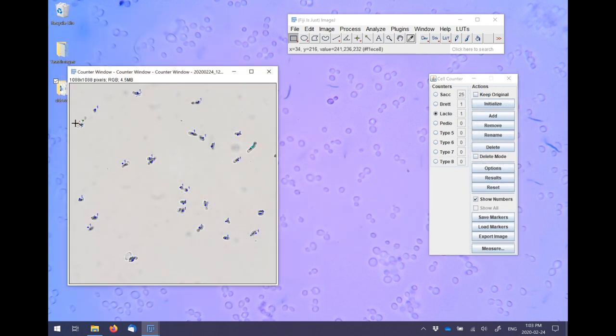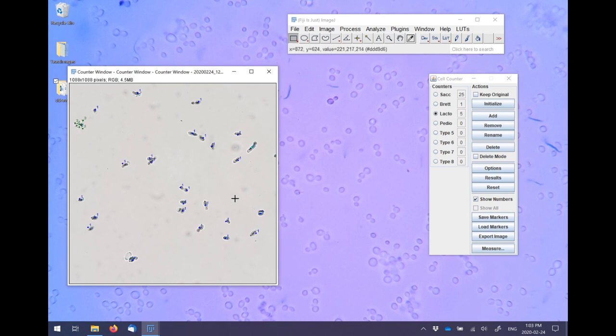Of course, if counting a mixed fermentation sample, you could create different counters for each visibly different yeast or bacteria. So you could have Saccharomyces, Brettanomyces, Lactobacillus, and Pediococcus counters.